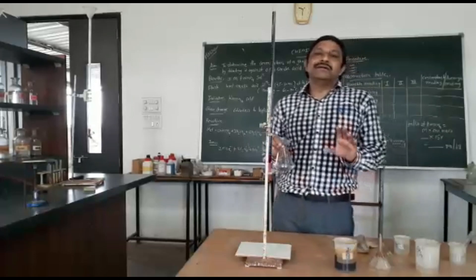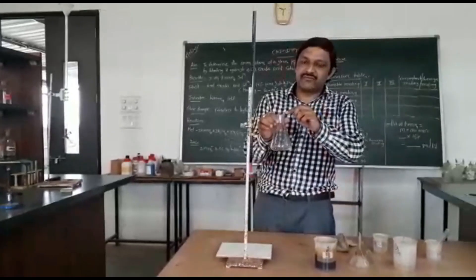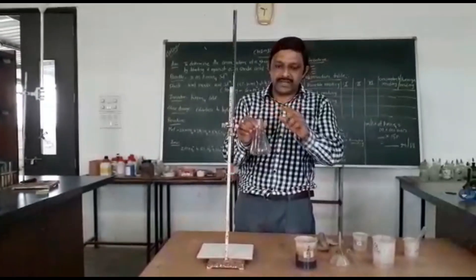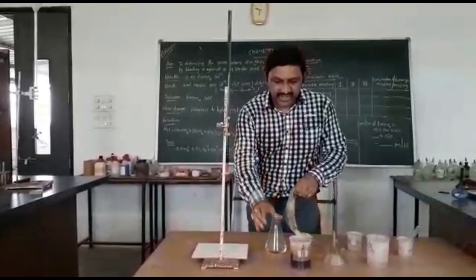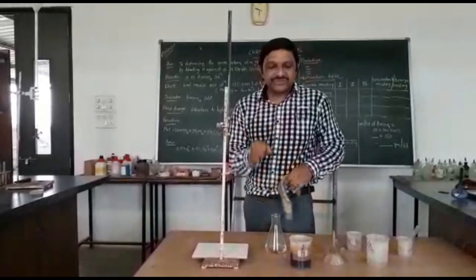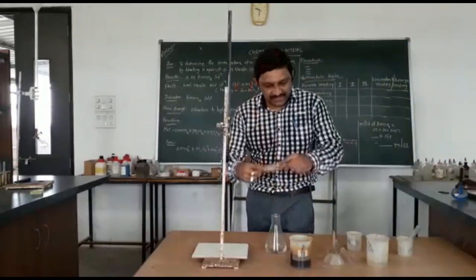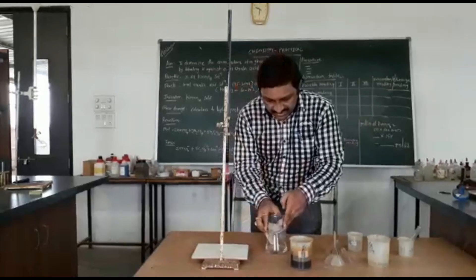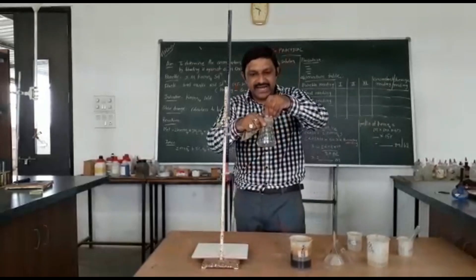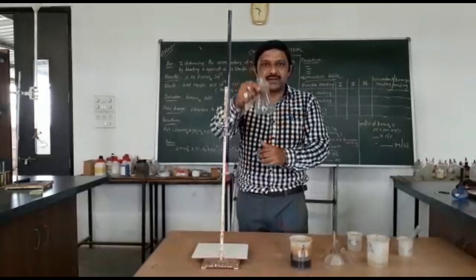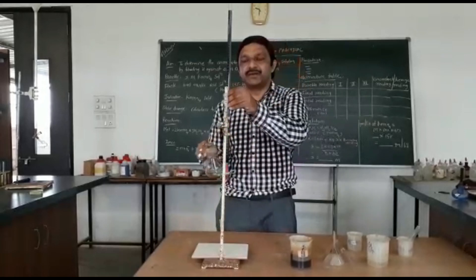You can see white vapour here, which means we have reached 60 to 70 degrees temperature. Now use your handkerchief to hold the flask and proceed to do your titration.